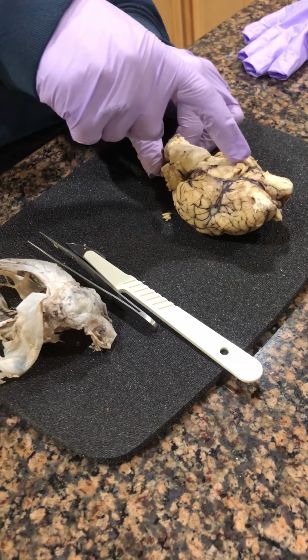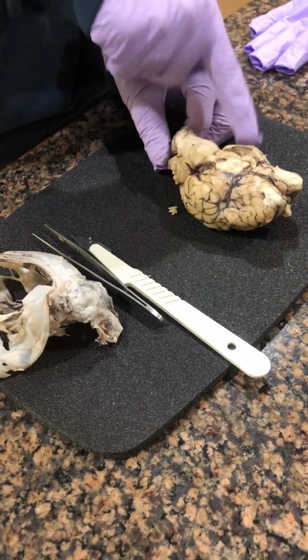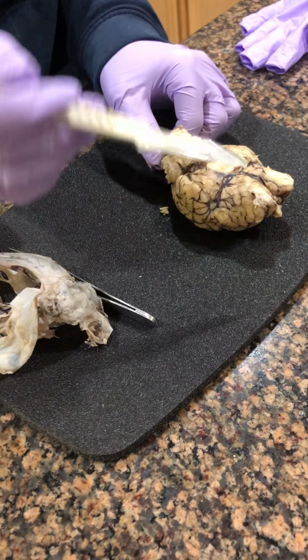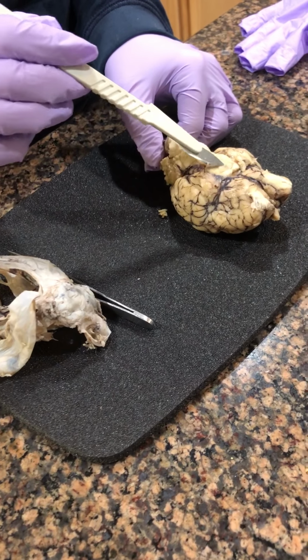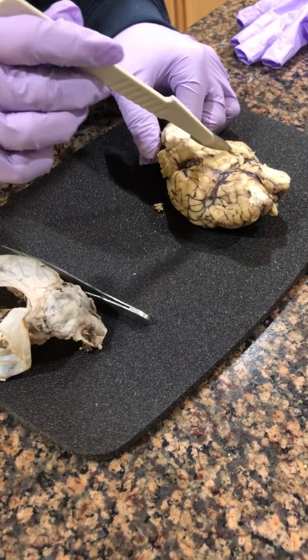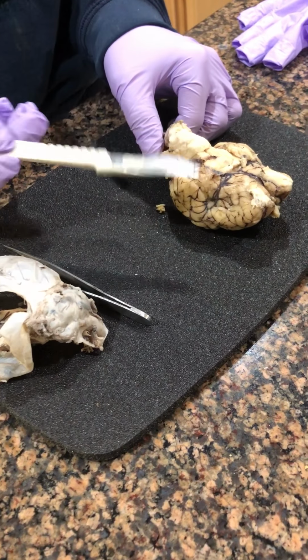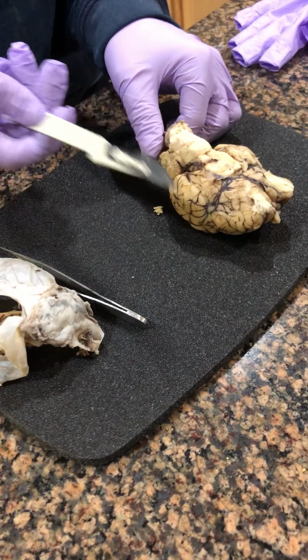The optic tract is this area right here, and these top pieces are the optic nerves right there. If you go onto the side, this is your olfactory bulb. The optic chiasma is right here. Your mammillary body is kind of centered right here in the middle. The parietal lobe will be over here, kind of to the top, but on the side.